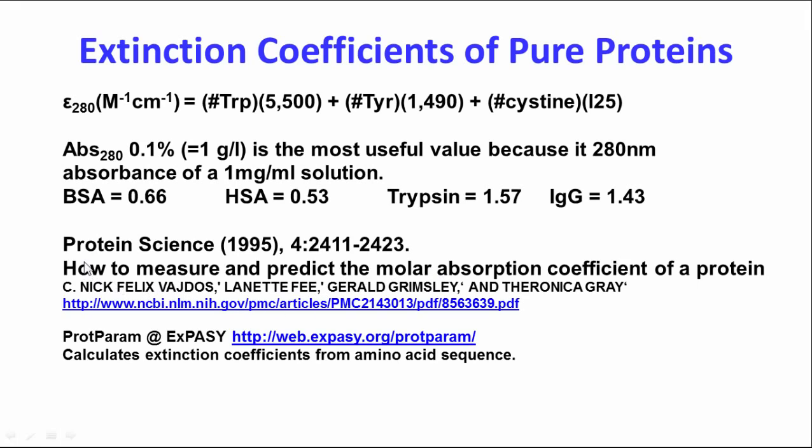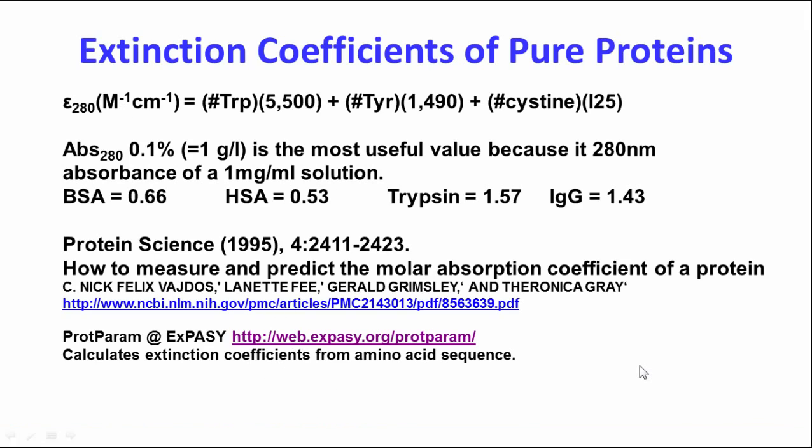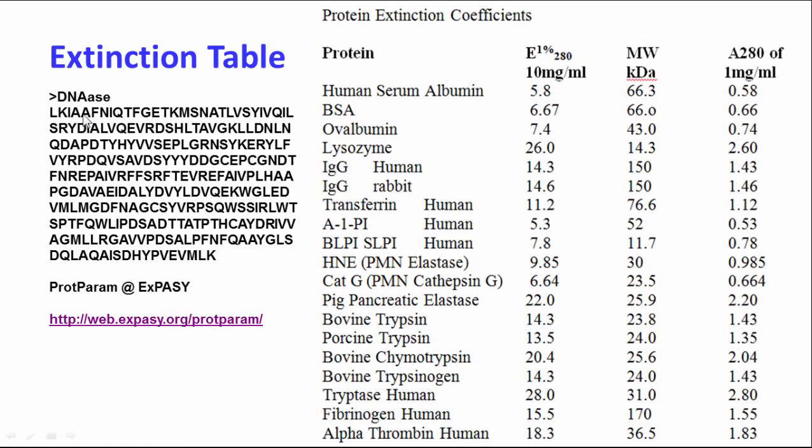Here's the reference for this, Protein Science, back in 1995, and here's a link to the proteomics website, the Expasy website, and we're going to go there.